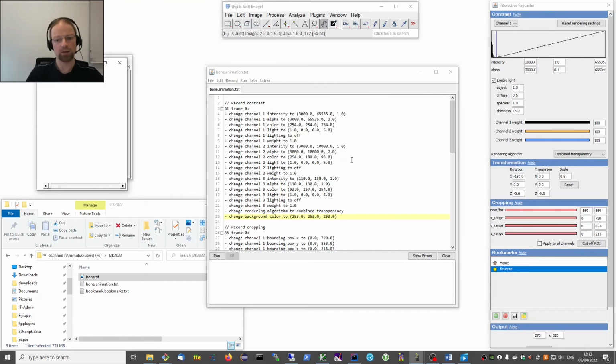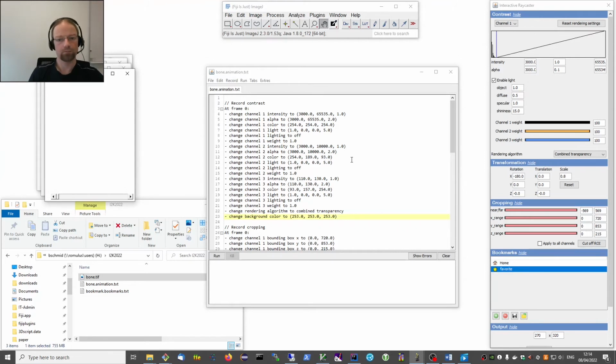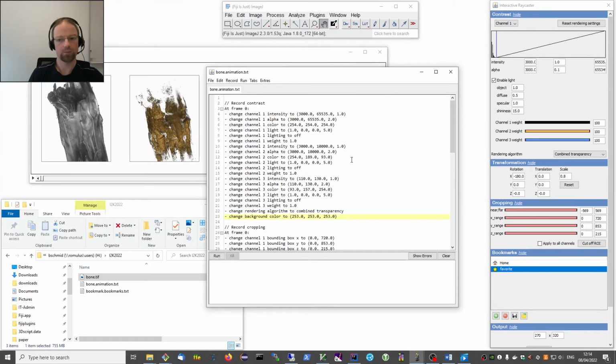This will now take a couple of seconds because it's still quite a long animation actually, and it will need to do it for all the panels, but we'll just wait for it. So it does one at a time. Here comes the last one. And so now it's done.